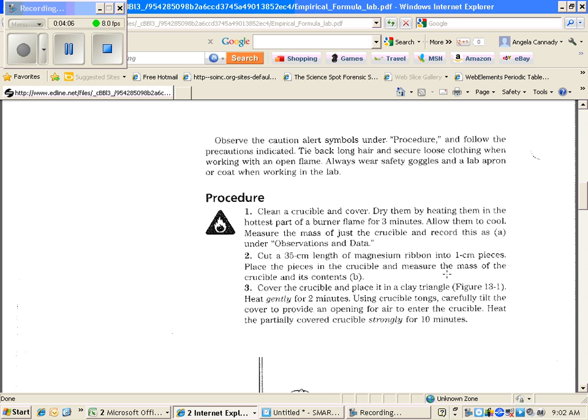Again, do not use the cover. However, the next part is pretty easy. We're going to just cover the crucible. We're going to place it on a clay triangle, and we're going to heat it.